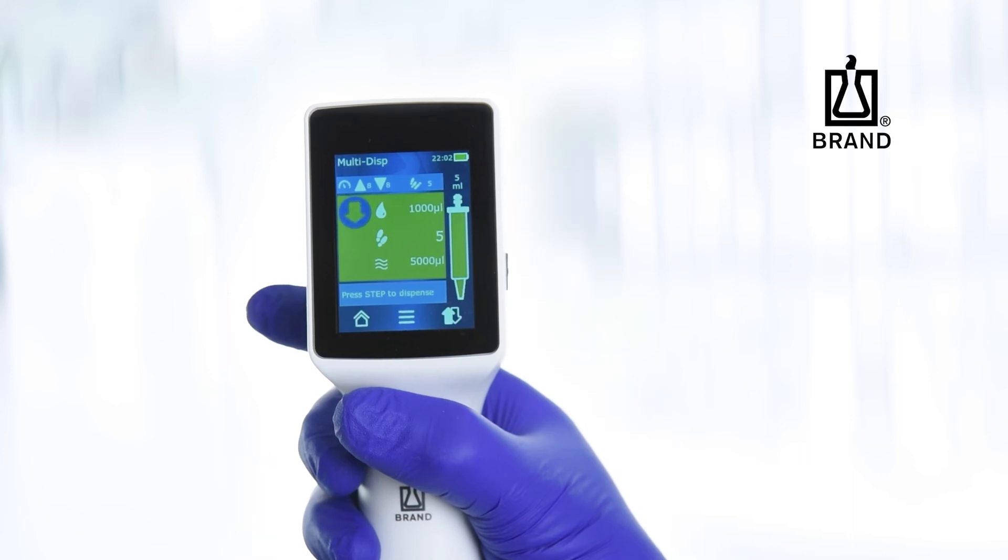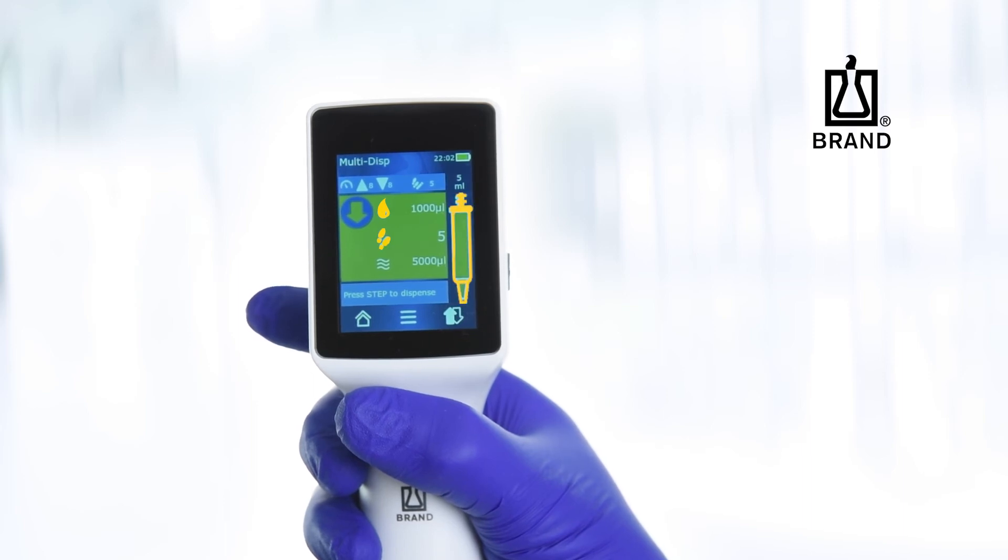The multi-dispensing screen menu or the operating screen displays the step volume, number of steps, and approximate volume in the PD-TIP.